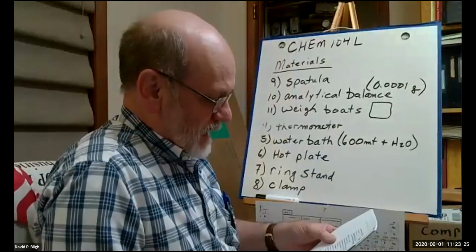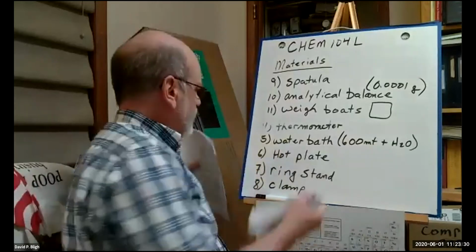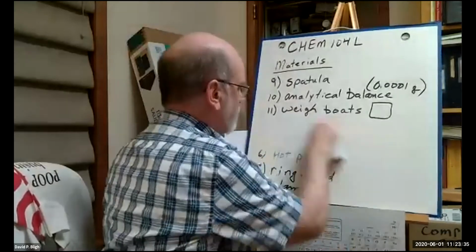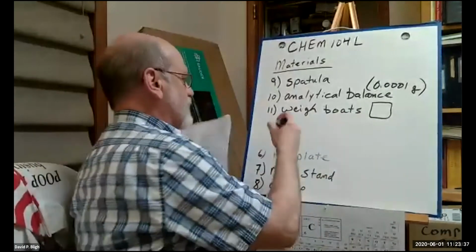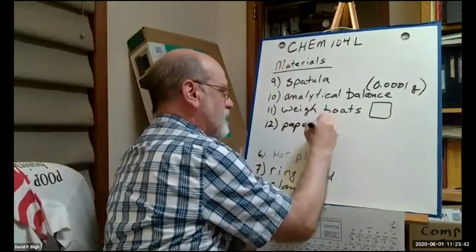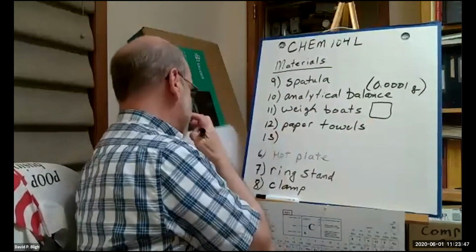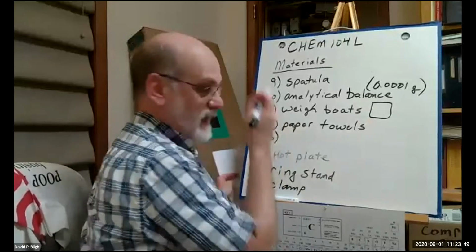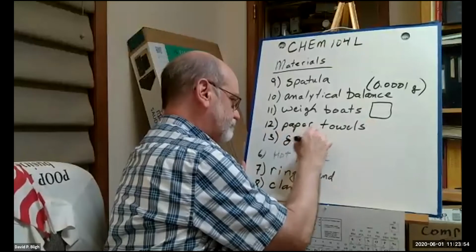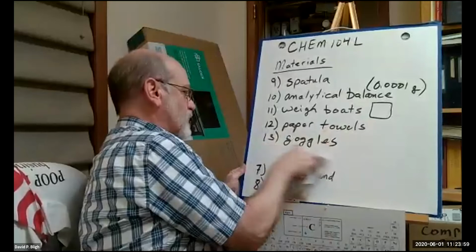Let's see. Now, it's probably a good idea to have some paper towels for spills. And what else? Safety equipment, goggles, and what else do we normally need?